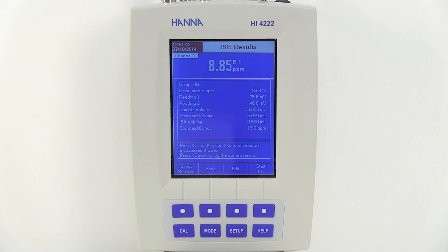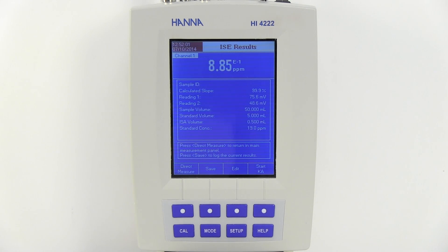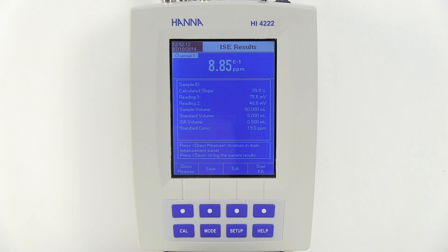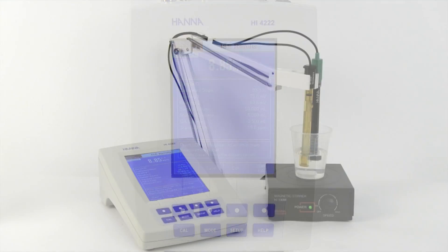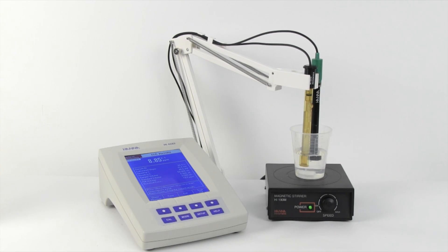The meter will now perform a calculation to determine the concentration of the original sample solution from the two readings that were taken. Our drinking water has a fluoride concentration of 8.85 × 10⁻¹ ppm fluoride, which is within the EPA limits of 4 ppm fluoride. While the calculation is built into the HI4222, it is possible to use any meter with the millivolt mode and perform the calculation by hand. Due to the complexity of the equation, it is much easier to use a meter with the calculations pre-programmed, which not only saves time but reduces the potential for any errors.